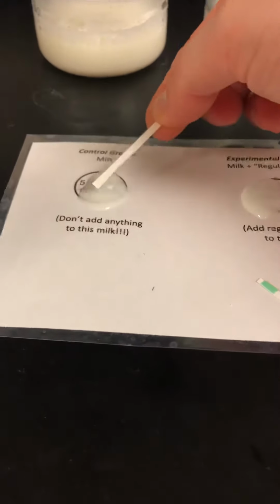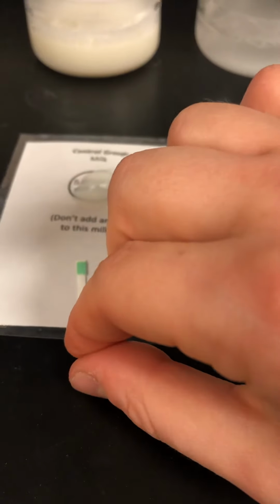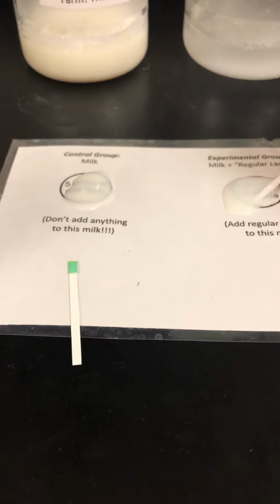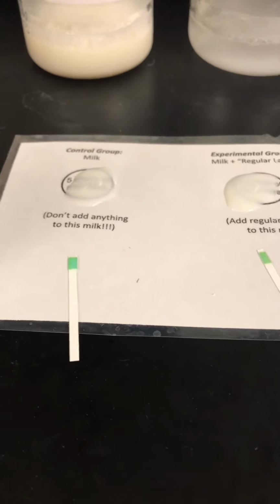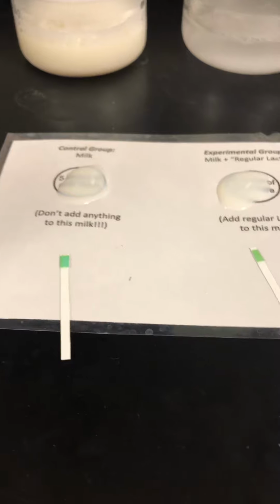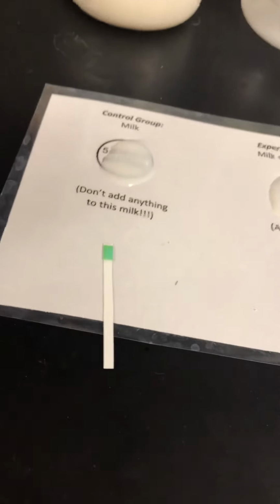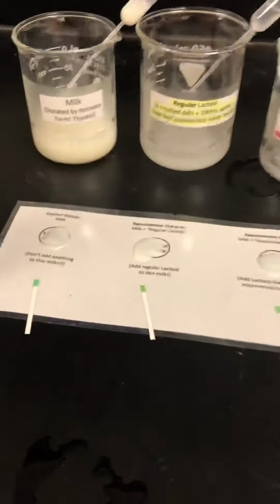Okay, I feel like it's been about a minute. All right, so we're going to dip our pads in there. And if we see a color change, that will tell us that our enzyme was breaking down the milk. And then we've got to give them a little bit of time to work. All right, so I'm going to pause our video here, and then I'll just take a picture of the results.